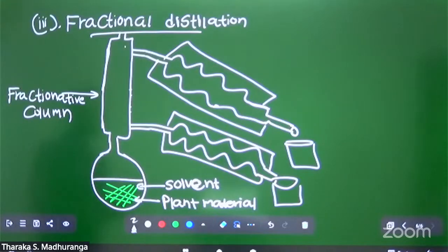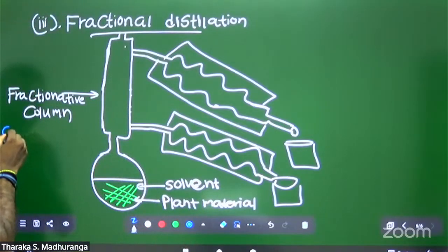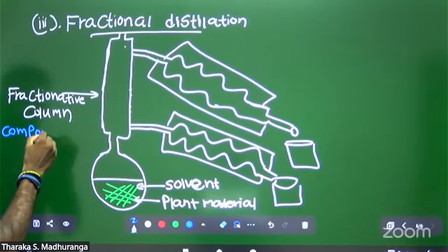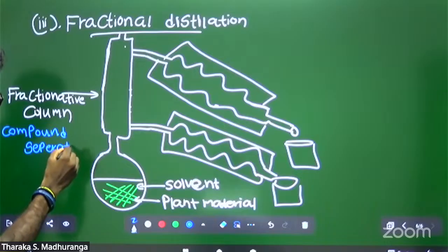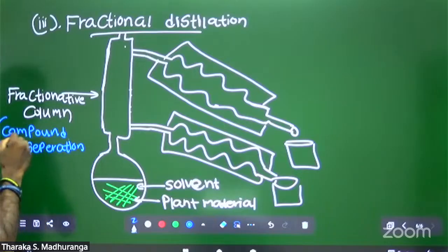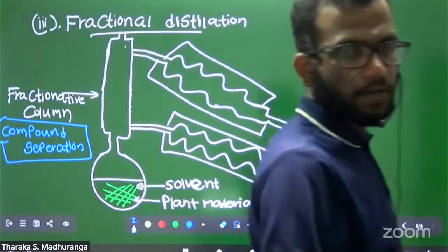Understood the distillation? The fractionating column's function is compound separation.